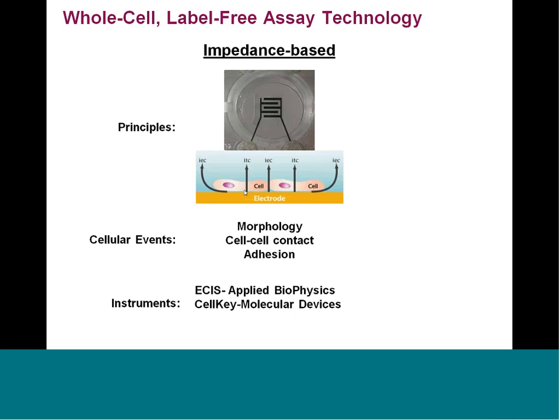Now, the latest iteration of this comes from ACEA with its xCELLigence. And here, rather than focus on the many different frequencies, as was done with the CellKey, they've narrowed it down a bit to really focus on faster processing, and whereas CellKey was every 2-second updates, xCELLigence is 12 milliseconds. So you can really get to fine gradations in signaling and really resolve cardiomyocyte beating.